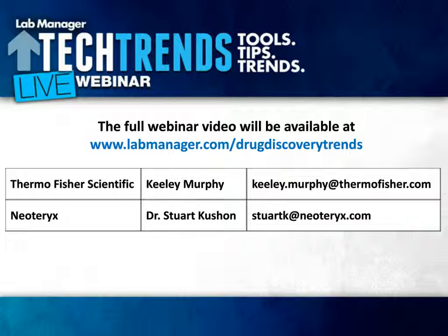The main difference between an MS/MS experiment on the Q-Exactive and a traditional triple quad instrument is that on the triple quad instrument, you need to know beforehand the mass of your fragment. On the Q-Exactive, after your fragmentation, the Orbitrap will be analyzing all your ions simultaneously because there's no additional filtering step. So you don't need to know what your fragment is going to be beforehand because the Orbitrap will detect it regardless. But yes, it is capable of MS/MS experiments, and it's there if you need it.